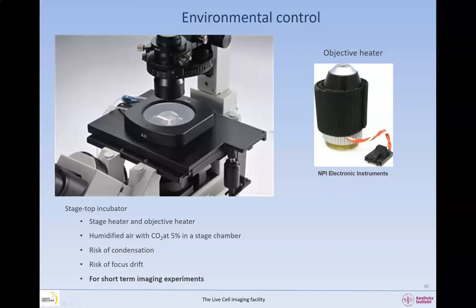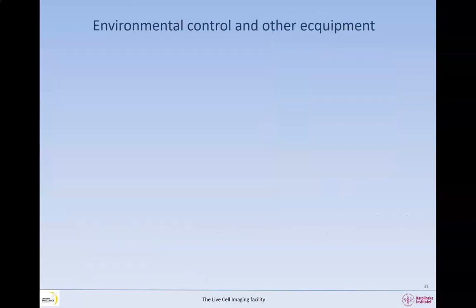These stage-top incubators are working well for short-term imaging experiments. Nowadays, you can also perform live imaging with small microscopes placed inside your cell culture incubator or using benchtop incubators with imaging capabilities. What else should we think about when it comes to the microscope of choice?